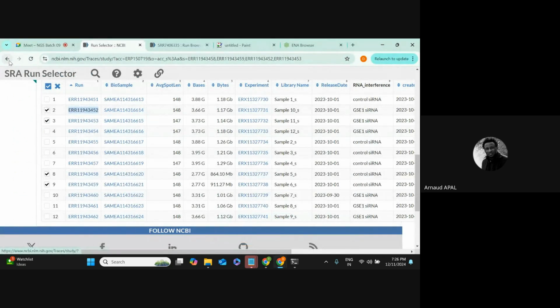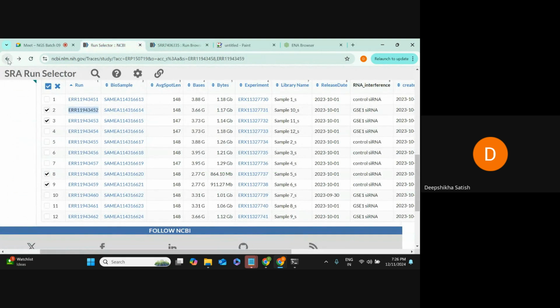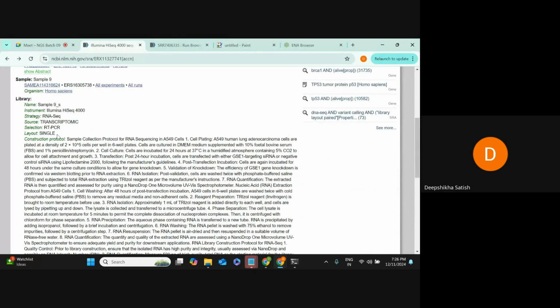I don't know, sir, this is your data. I've shared this link also with you. Just check it from here also. This is your single end data.